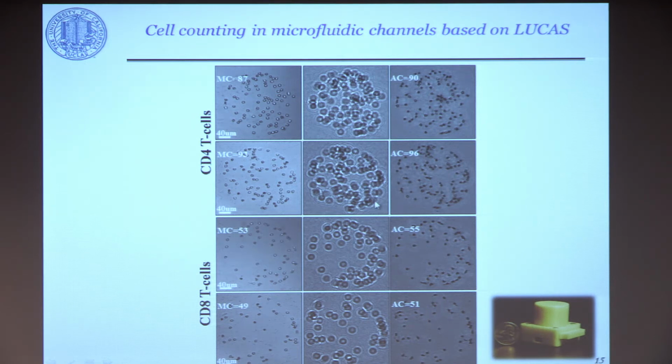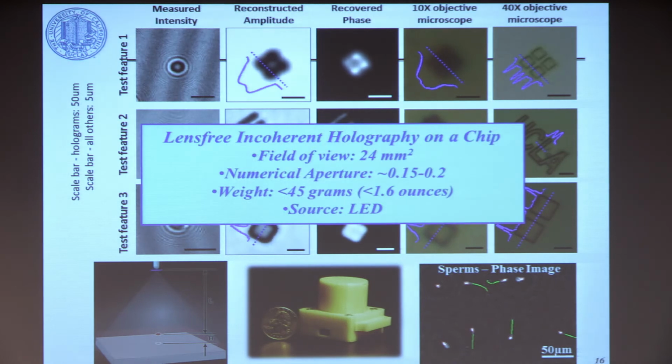And it can give you images that, in this simple design, may be about a 10x objective lens, which means you're looking at a resolution of about 1 micron to 2 microns, a modest resolution. But one major advantage here is the field of view. These are large field microscopes. Large area samples can be seen with these microscopes because these are unit magnification designs where the chip's area is your field of view. So this is a huge advantage because traditional light microscopy is typically a millimeter square in field of view. So you have an advantage here, but resolution is modest. That's something that you can expect from a 10x objective lens, as I've said.